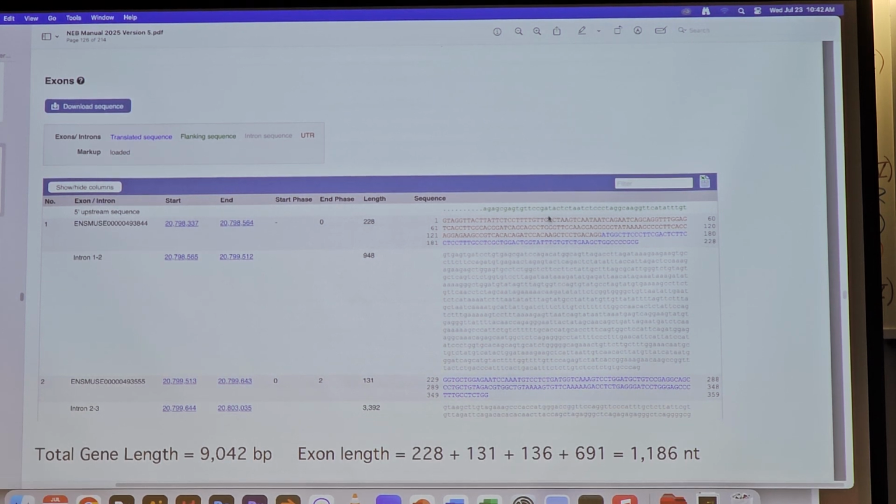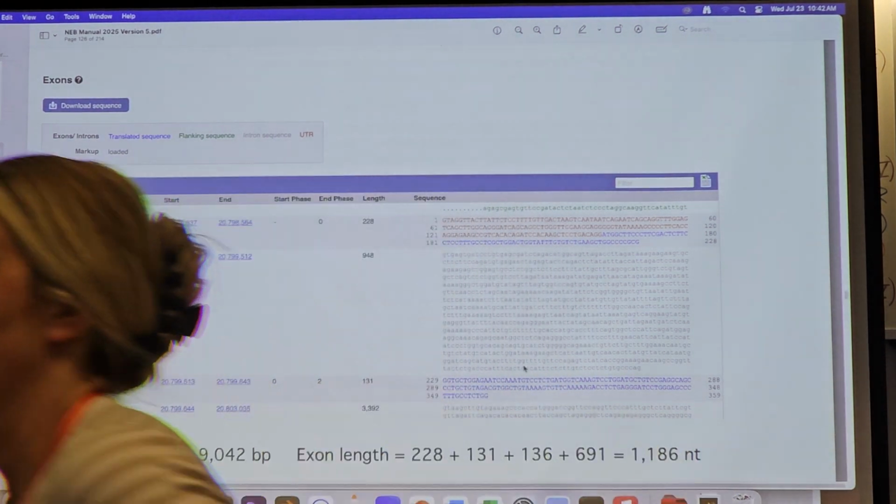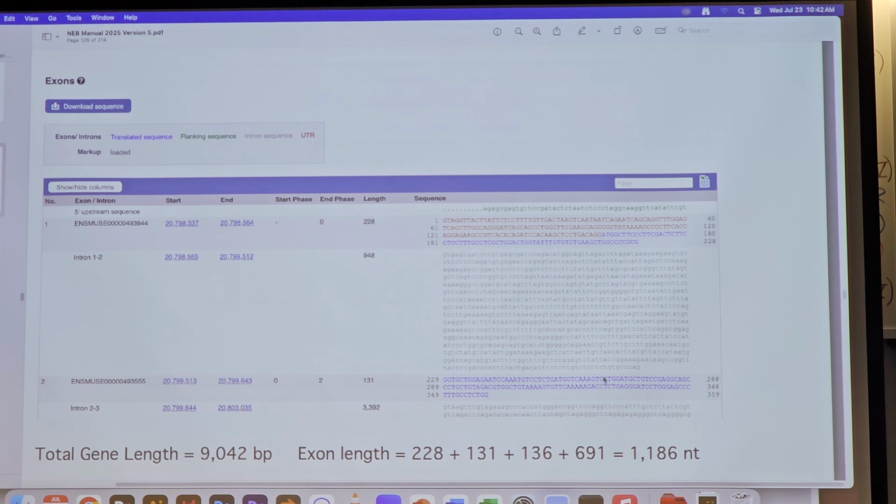Okay. Now, where are our primers? Our primers are located right in here. There's a forward primer here, right in this area, and the reverse primer is down here in exon 2. And what we would amplify would be this sequence of exon 1, and then the sequence of exon 2 until we get to the primer. It's a pretty short sequence, only 150 base pairs.